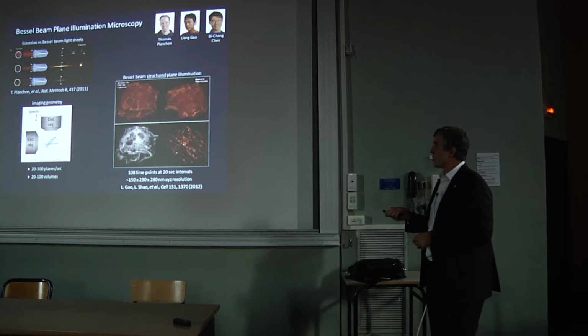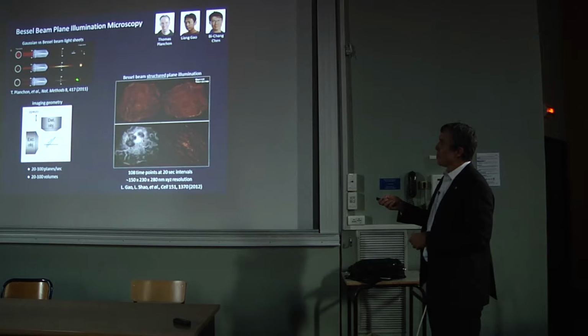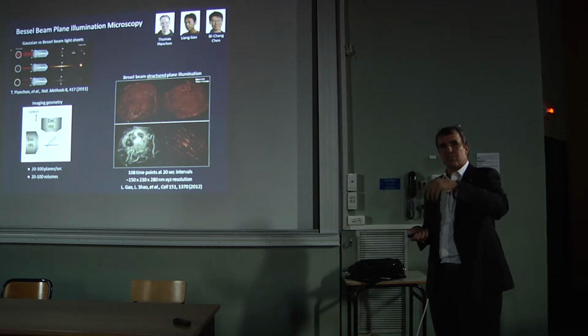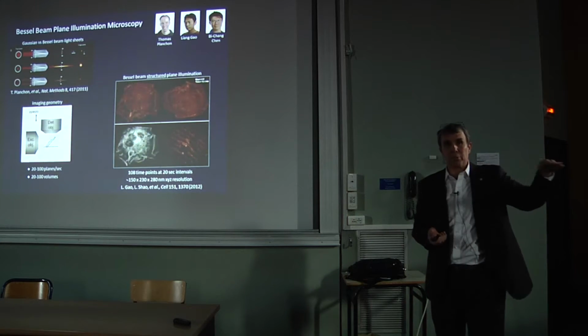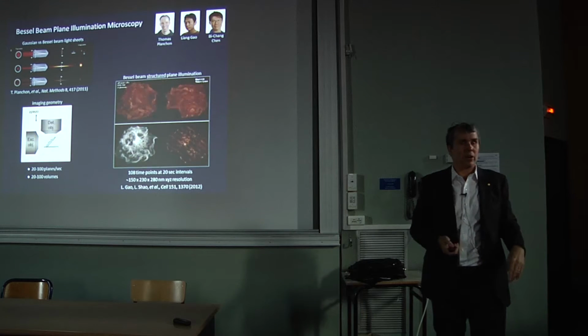There's a problem though with the Bessel approach, and you'll never see it on this screen here, but a Bessel beam isn't just a pencil of light. In cross-section it looks like a bullseye with these concentric rings of progressively dimmer side lobes. And as you sweep the Bessel beam across, that creates some out-of-focus excitation that you don't want.